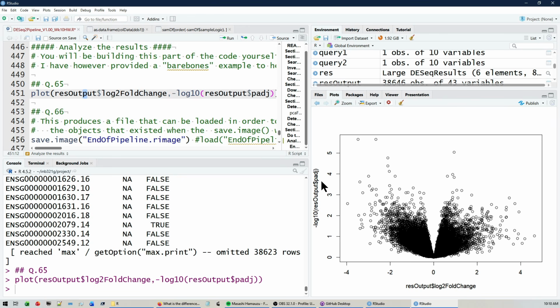So anytime I say, is it differentially expressed, I am specifically referring to, is it significant in p-value? If I say, is it strongly differentially expressed, that might be where I am saying, is it both significant, so high on this plot, and also interesting in terms of how far out it is and how strong that overall differential expression was.